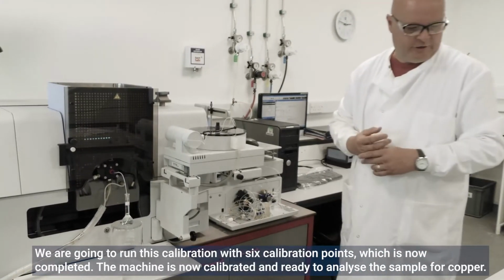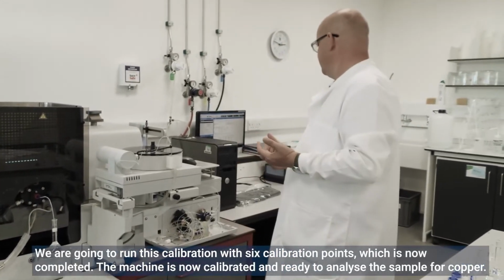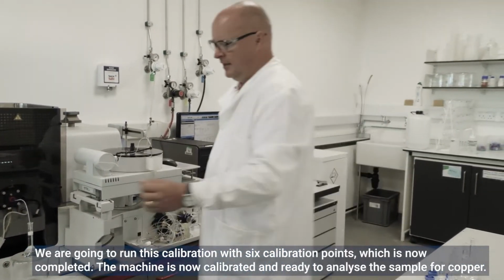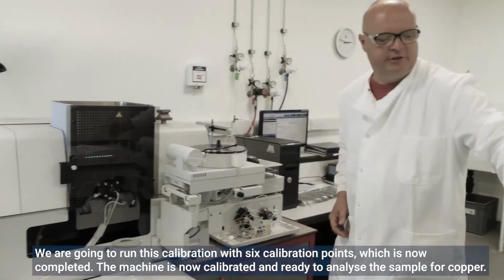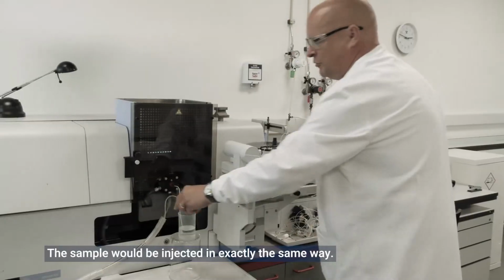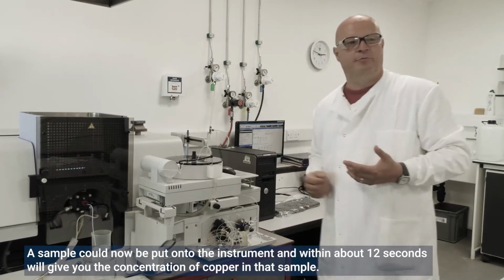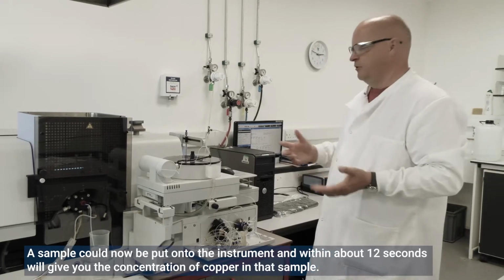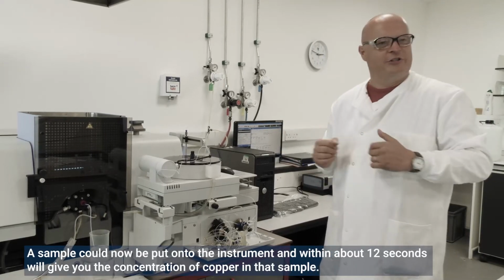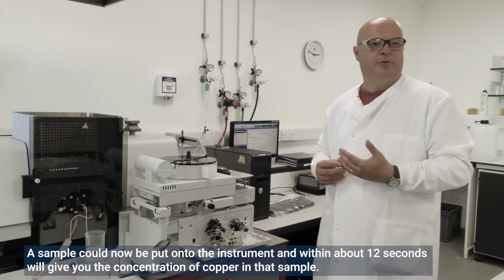So on this, you're actually going to run a calibration with 6 calibration points, which is now completed. So the machine is now calibrated and will be ready to actually analyse a sample for copper. The sample would be injected in exactly the same way. So a sample can now be put onto the instrument, and within about 12 seconds, it will actually give you the concentration of copper in that sample.